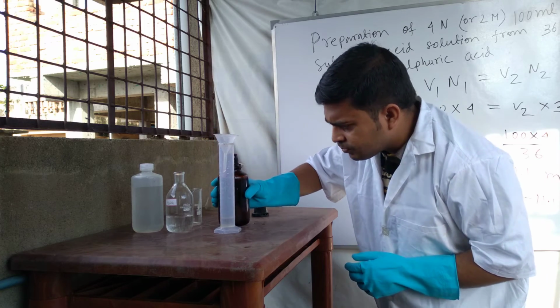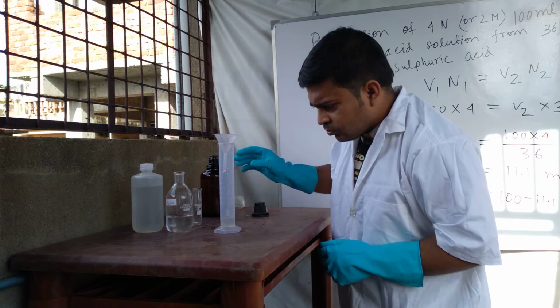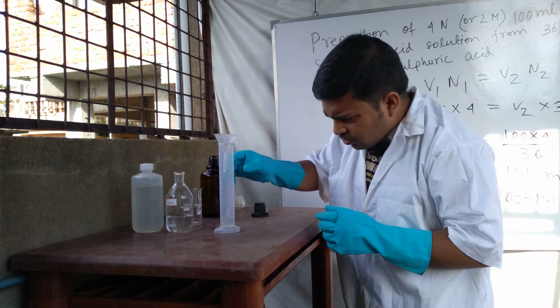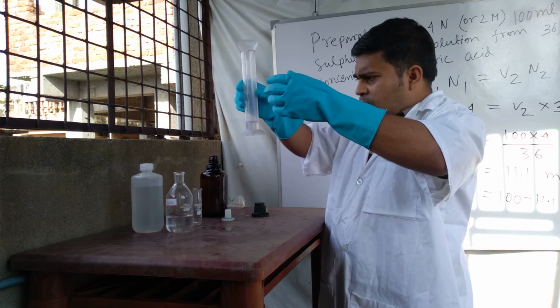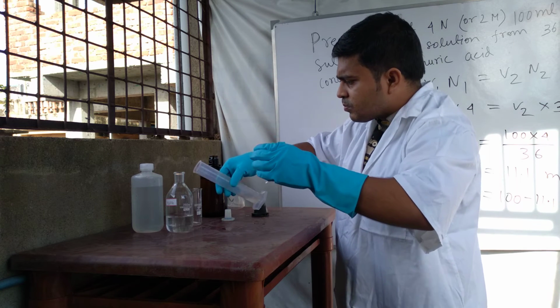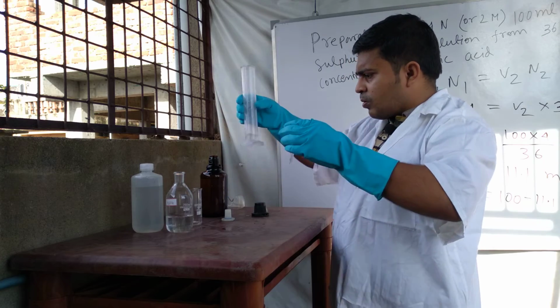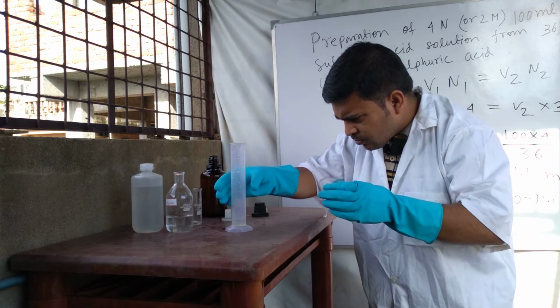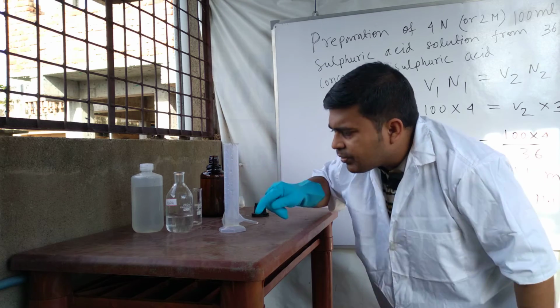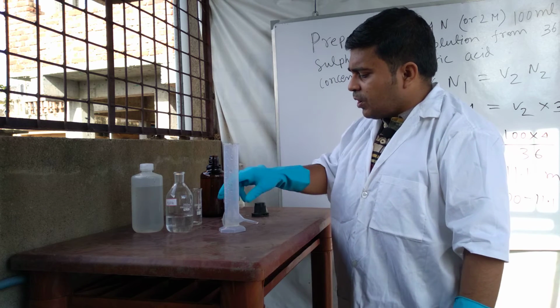It is more than 11.11, so right now it is exactly 11.1 ml of concentrated sulfuric acid.